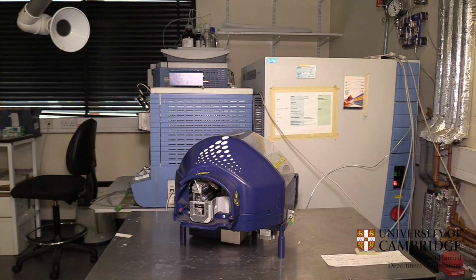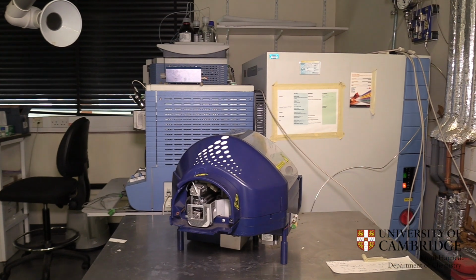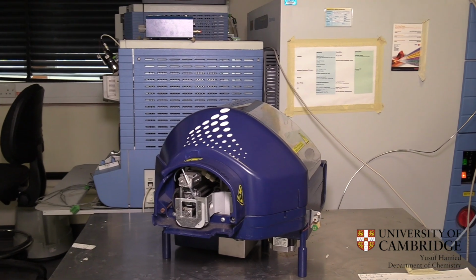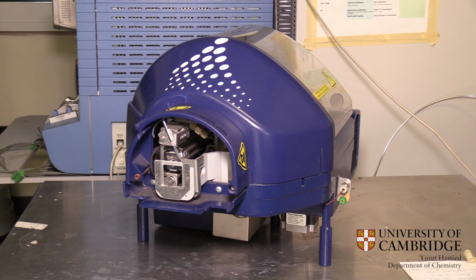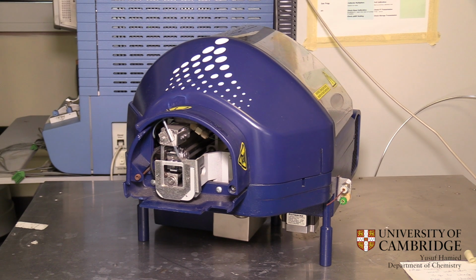These flowers have very important characteristics because they have some striation on the surface, and this striation can reflect the light at different angles, creating a sort of halo that attracts pollinators. What we didn't know was how the plants can make these striations with these beautiful colors. And thanks to this type of instrument, we can make chemical characterization of different parts of the same petals to see if the chemical composition is different. And so understand whether it is a chemically driven process that forms these striations or a physically driven process.